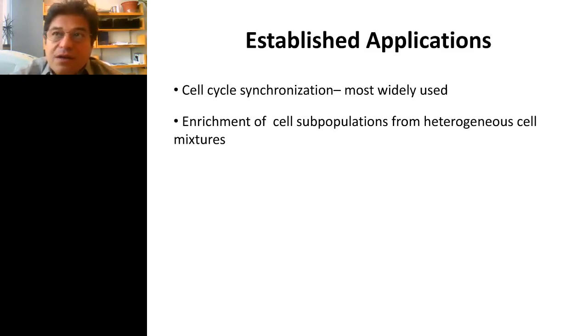Like I said, having a setup like this in a core environment, with staff gaining expertise in the system, an institute would really benefit from having this as an offering, because you could process many different types of cells in many different scenarios. Whereas in a lot of cases in the past, I think the elutriators have ended up working in just one particular aspect of their capability, and then after the experiment's done, the elutriator probably doesn't see a lot more action.